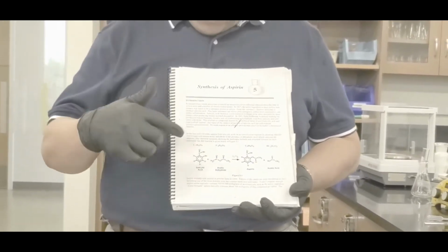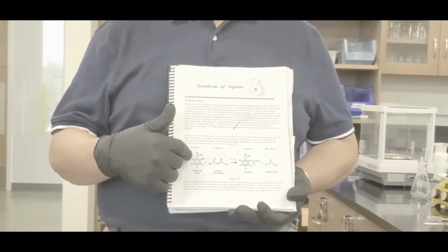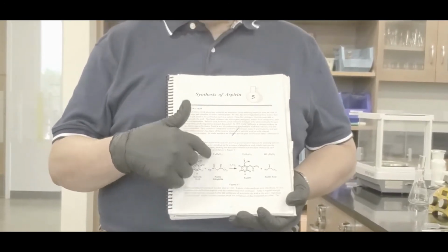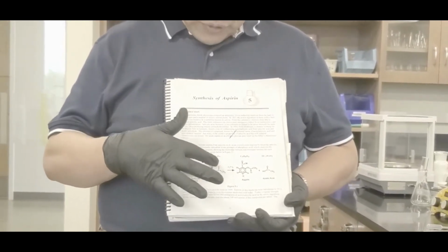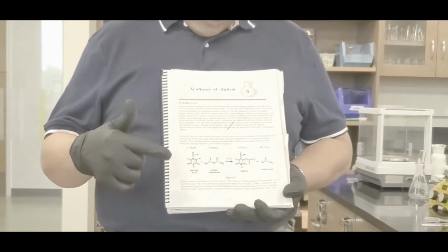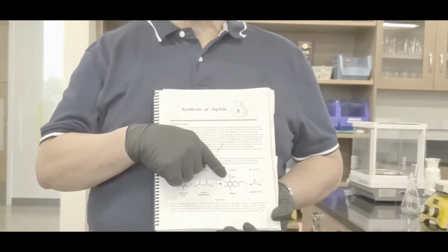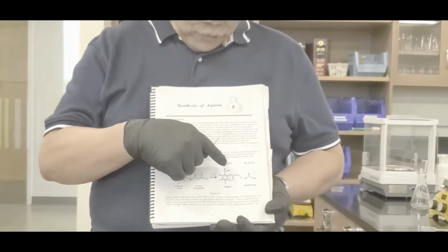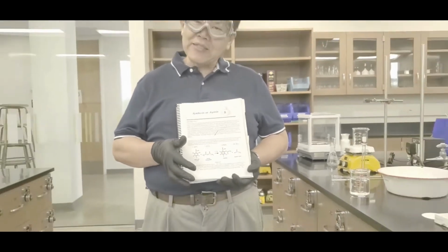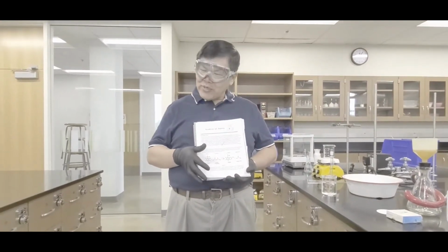Now, therefore, we're going to go from salicylic acid, which is like a compound in a Neutrogena anti-acne wash, that's what that's for, reacting with a corrosive substance called acetic anhydride. And what happens, you cook it with the help of phosphoric acid, and what you'll get is aspirin right there, which is technically called acetylsalicylic acid, yeah? And then of course you'll also get acetic acid. So in lab, don't be surprised that the lab's going to smell like a pickle factory afterward. So that's the reason, okay?